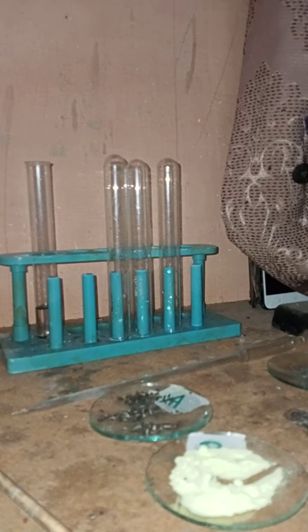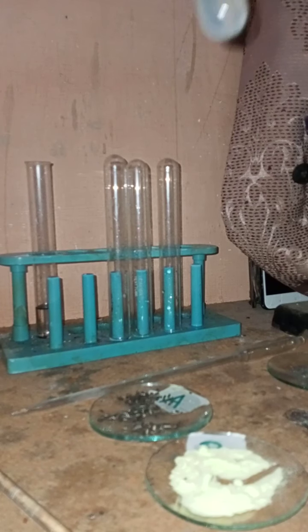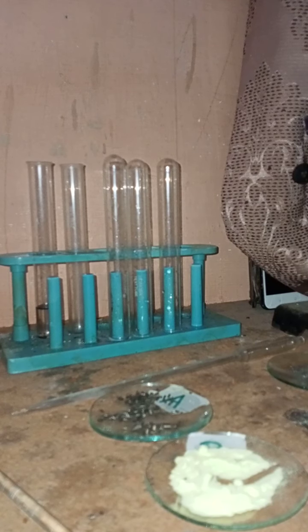Let us do the filtration of the solution so that we can understand that the kind of solution that has been formed is a pure solution of sulfur powder and carbon disulfide. You can see that there is a process of filtration.